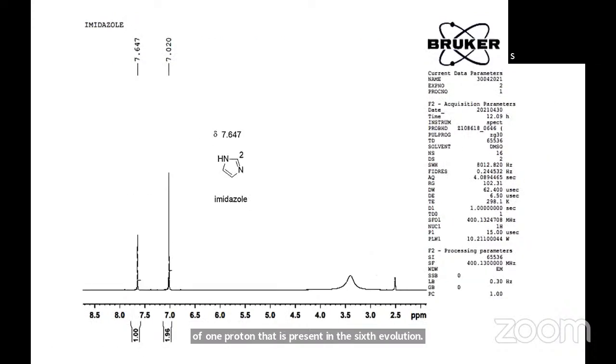And for internal standard, we are using imidazole. Imidazole is an experimental internal standard. We are the first to use imidazole as internal standard. So here, because this is a symmetric compound, we get one signal for the proton present on 2nd carbon and one more signal for the protons present at 4 and 5 positions. Okay, so this is one of the signal. This is the second signal.